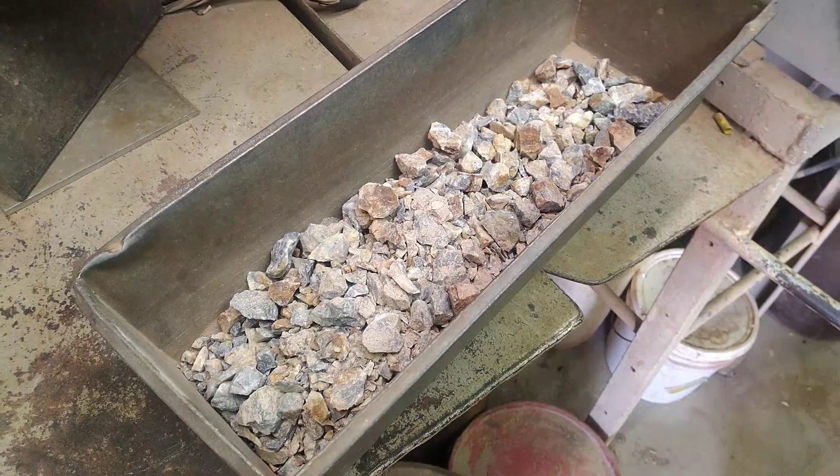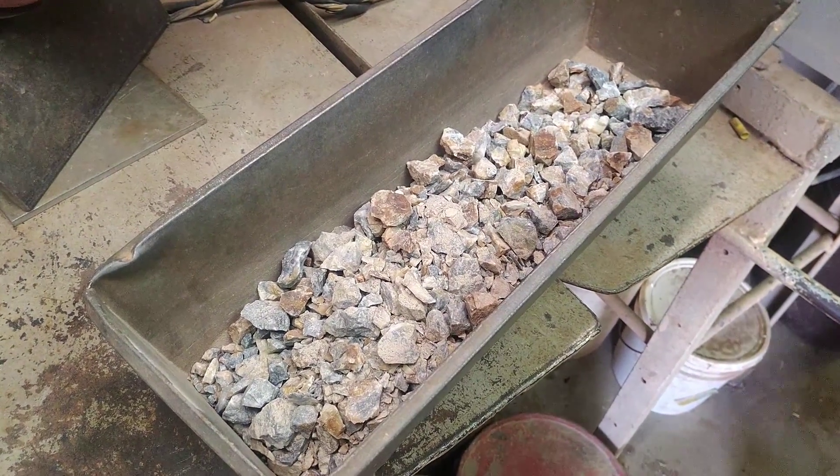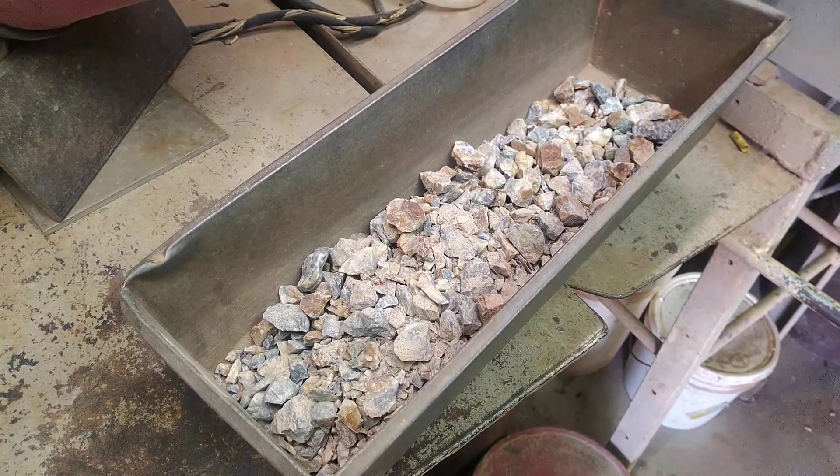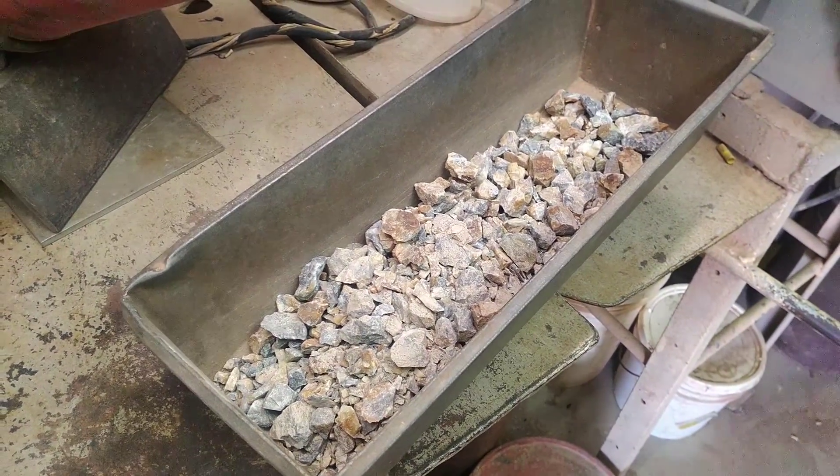This is our BA or B001 sample after it's been run through the production jaw crusher. Now it's going to go through the chipmunk and the pulverizer.